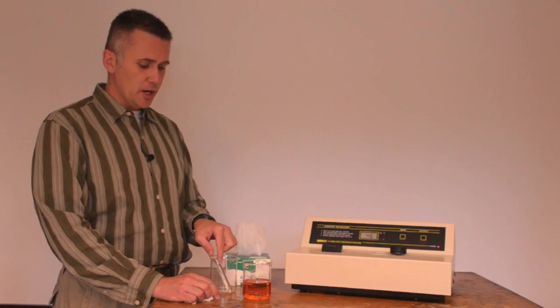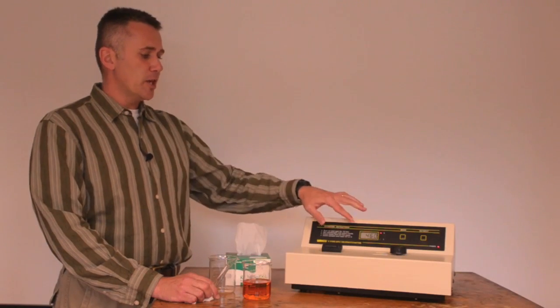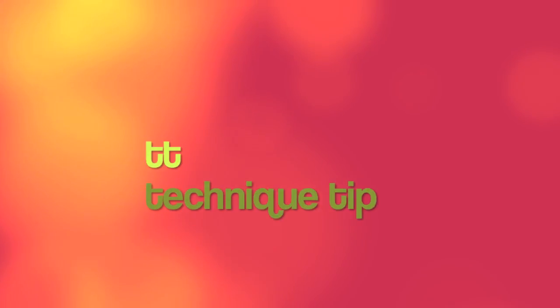And you're going to collect about 10 to 12 data points in each way, and each time you should blank with water and then put your sample in and read its absorbance.